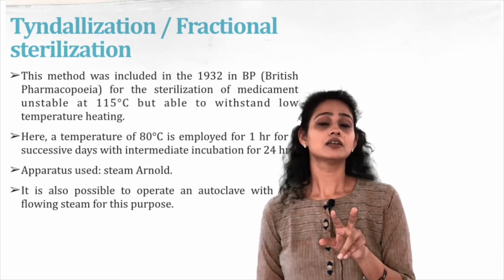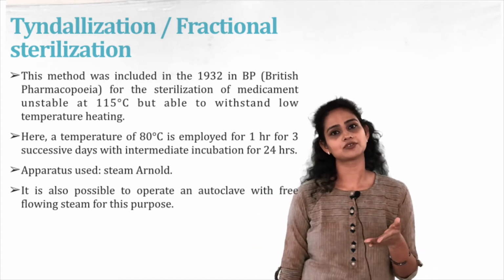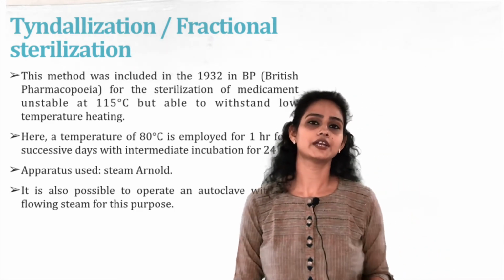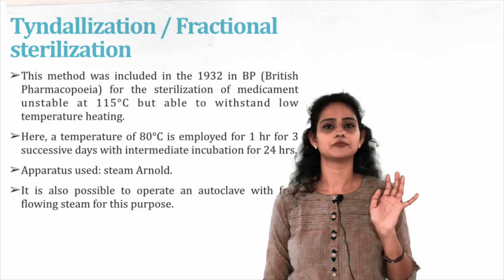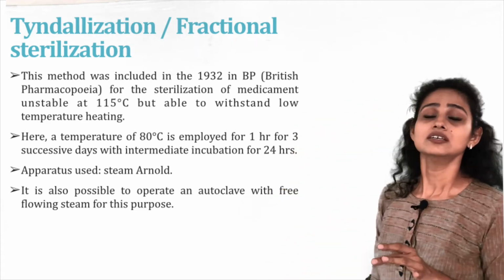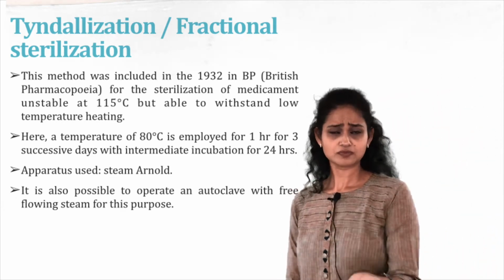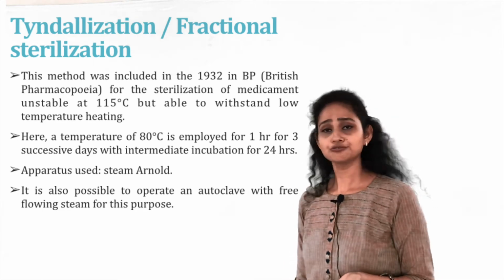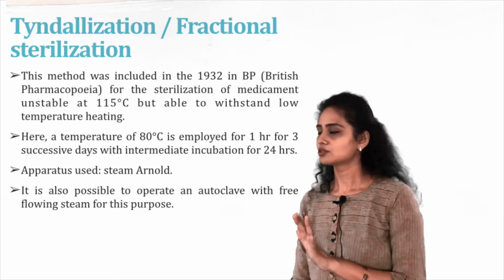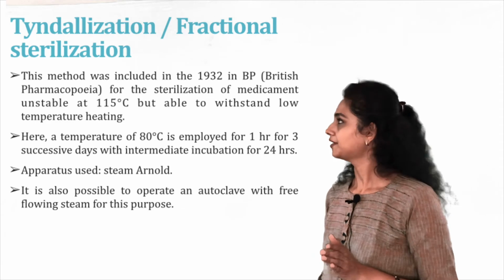So, this we are repeating for 3 days, and it is said that by performing this method for 3 successive days, most of the microorganisms, that is 99.99% microorganisms, can be killed, right. Okay, so the instrument which is used for this method is steam Arnold, which is very similar to your autoclave, right, or you can also use autoclave without using the pressure valve, okay. So, yes, this is fractional sterilization or tyndallization, right.